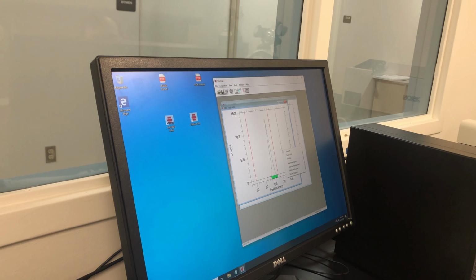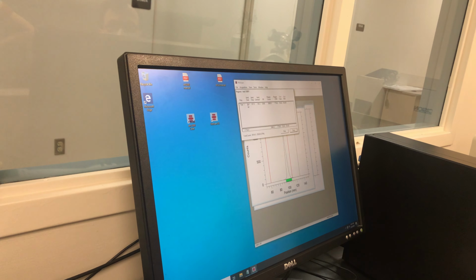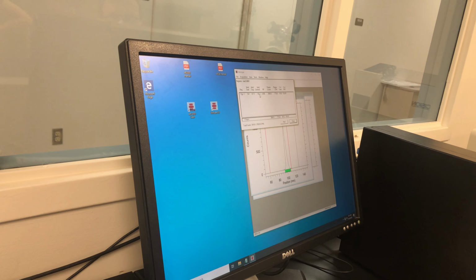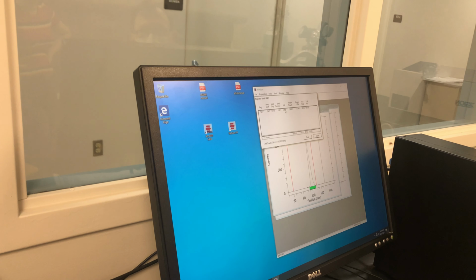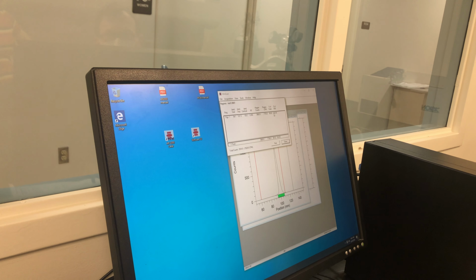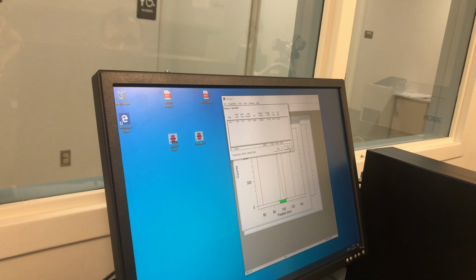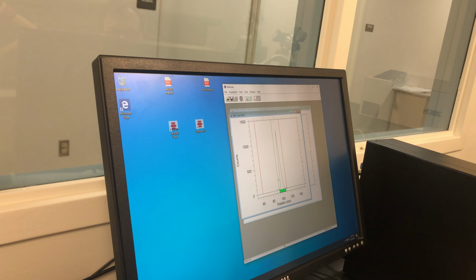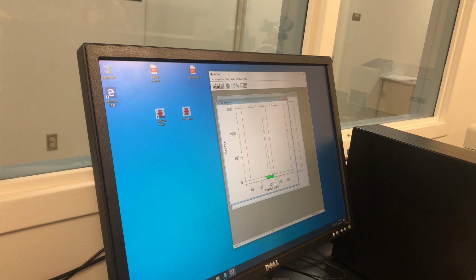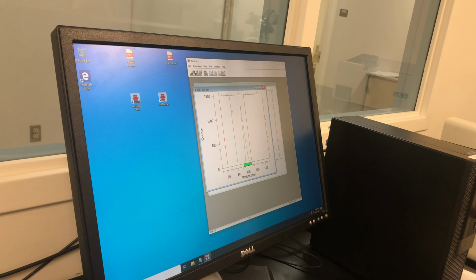We can right click to review the regions, etc. So the peak started at 94 millimeters, ended at 108. The center of it is at 100. The RF, the retention factor, is 0.806, and you got 3868 counts, and 98% of the total activity is in the peak. If you say, I'd like to make this a little bit bigger, you can just tweak it by dragging it with the mouse.